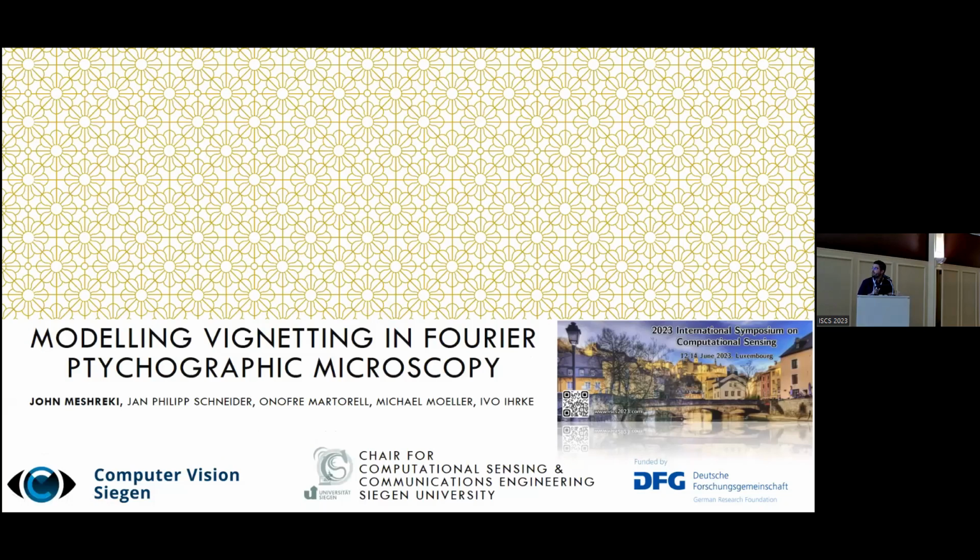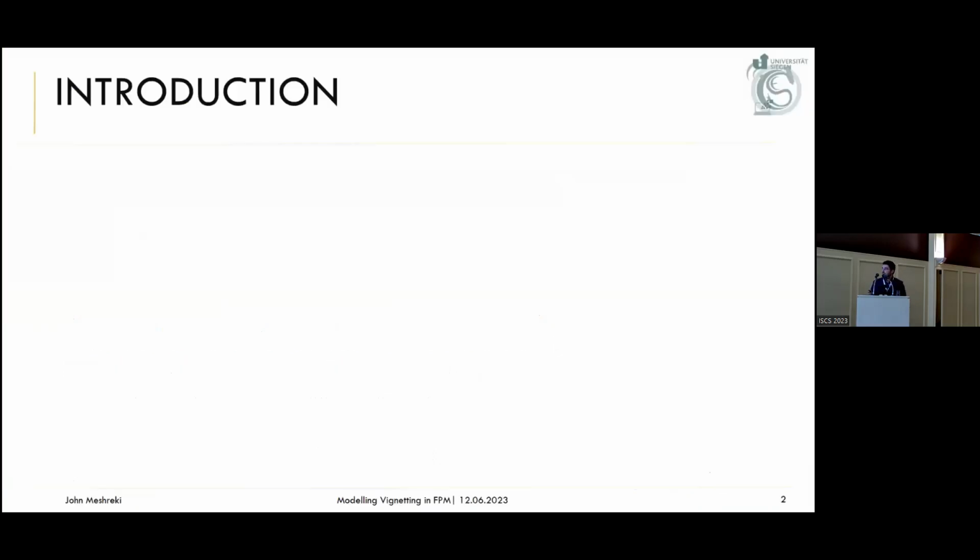Welcome to my talk. My name is Meshreki. I would like to present our recent work on modeling vignetting in Fourier Ptychographic Microscopy. Let me start right away by introducing what Fourier Ptychographic Microscopy is, or for short, FPM. Although you may have heard about it, I will try to go into more details.